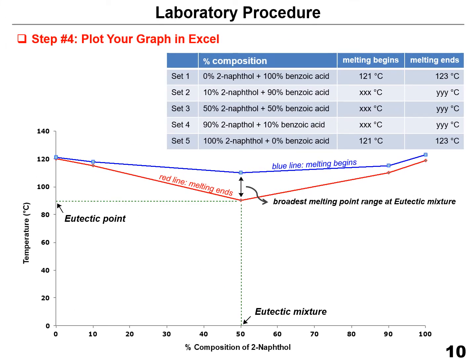Once you conduct the experiment, your next task will be to put down the data, and the data can be recorded with respect to each sample. You can just take the melting point of the pure samples directly because they are known, but because you'll be measuring them, you can also put your readings directly into the table.